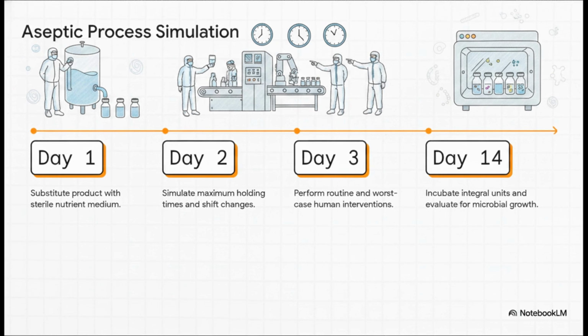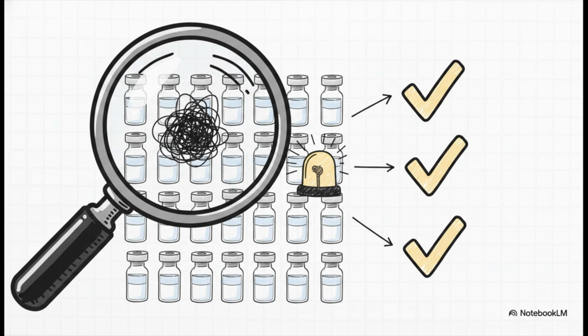They're setting a trap. After that, they incubate all those sealed vials of broth. They are hunting for breaches. If even one single microbial colony grows in those thousands of incubated vials, the fortress has failed. Period. Engineers have to find the breach, fix it, and then successfully pass 3 consecutive simulated runs before real production is legally allowed to begin. The standards are absolutely unforgiving.